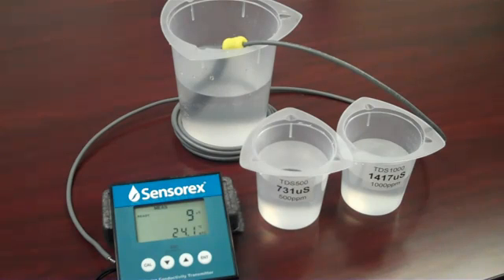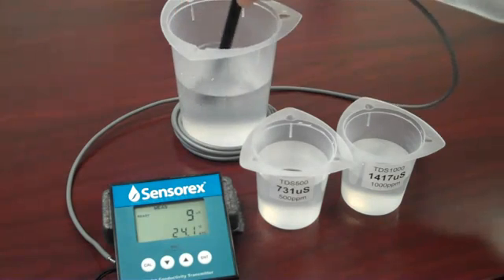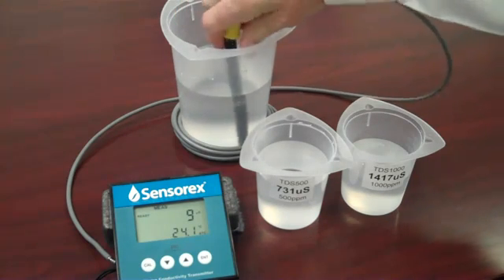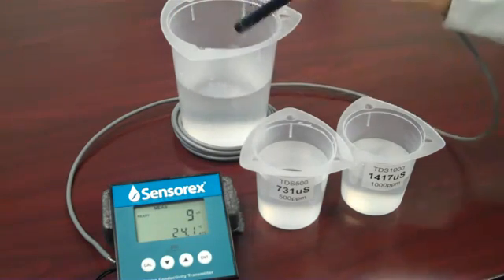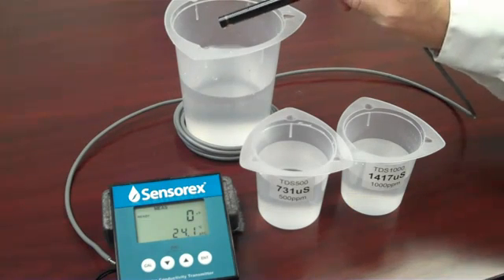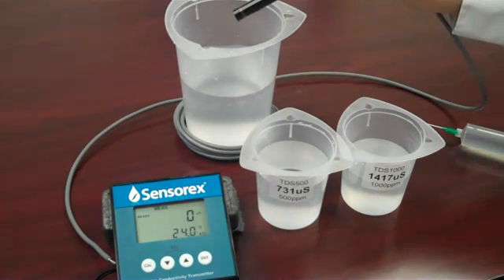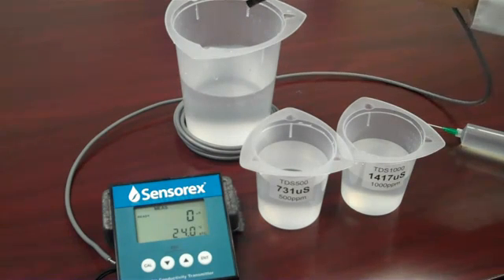Place the conductivity sensor into a container of clean rinse water. Use deionized water or distilled water if it's available for critical applications. Remove the sensor from the rinse water and rinse it with a small amount of the conductivity standard for best results. Then place the sensor into a beaker of the conductivity standard solution.